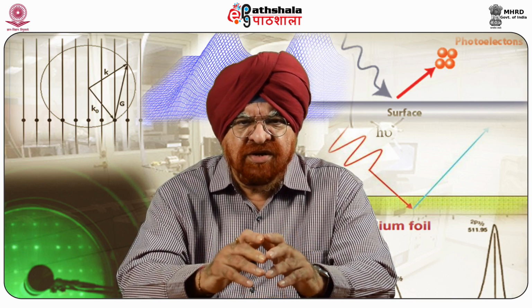When we come down to the basic concept, we will know that the magnetization behavior of a ferromagnetic material is governed by the characteristics of the magnetic domains and their dynamics. Magnetic domain imaging provides the most direct access to the effective magnetic properties from macro to nano scale, from fundamental and application points of view.